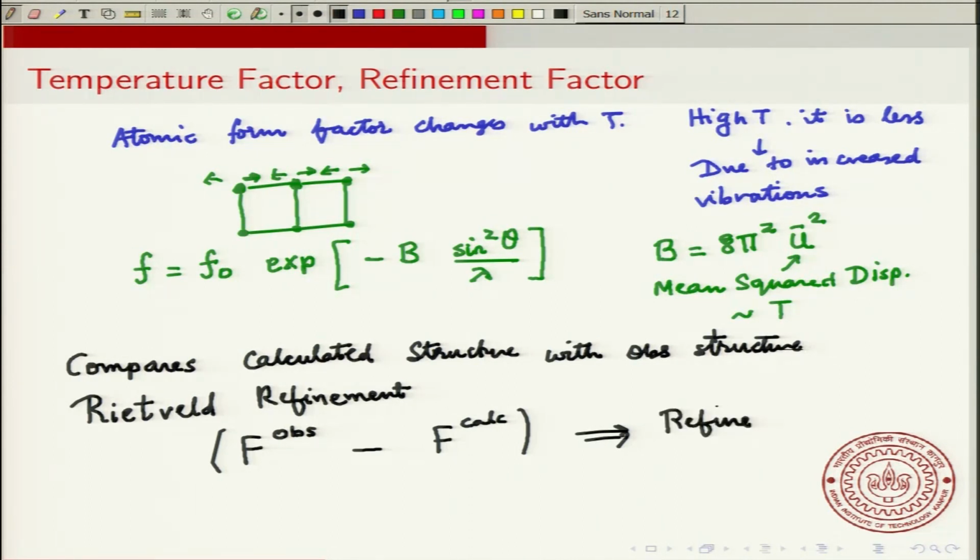Now, it is actually quite a complicated program, and I will not be getting into the details of how it works, but it is good to know that there is such a procedure in all the X-ray machines. I will just mention here that it is automated in most instruments, in most modern XRDs.